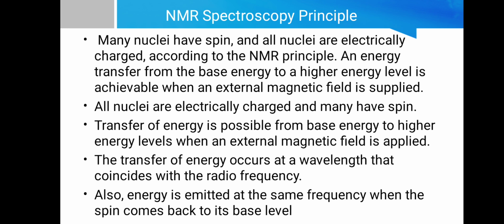Many nuclei have spin and all nuclei are electrically charged according to the NMR principle. An energy transfer from the base energy to a higher energy level is achievable when an external magnetic field is supplied. All the nuclei are electrically charged and many have spin.